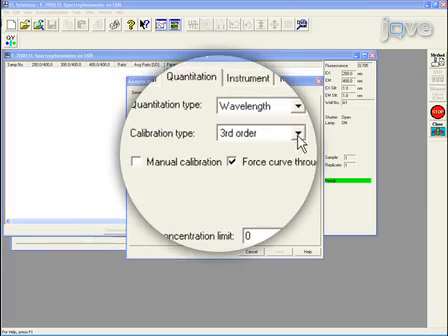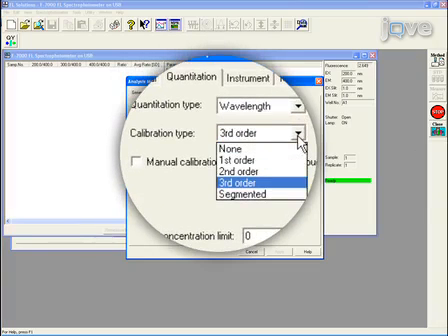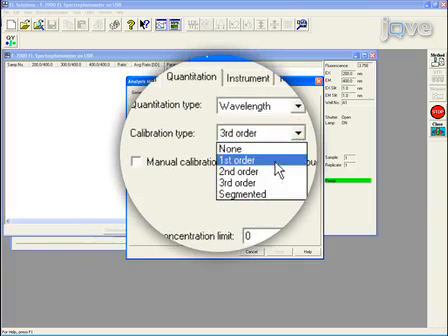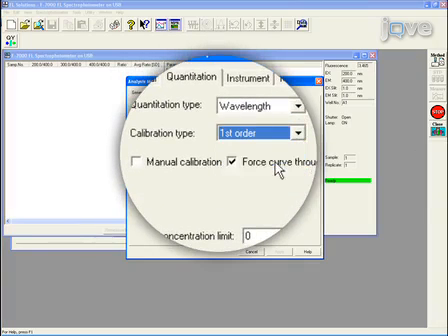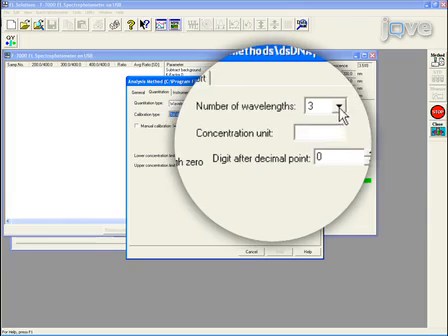For the calibration type, select first order. And for the number of wavelengths, select one.